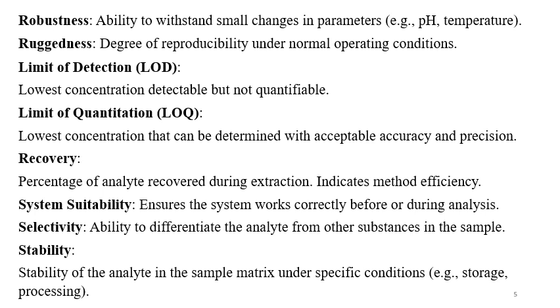Then is the recovery. Percentage of analyte recovered during extraction indicates the method efficiency. Suppose you are adding 10 mg to the solution and you are not getting the 10 mg back, that means recovery is not there. Recovery is the percentage of analyte recovered during extraction, which indicates method efficiency.